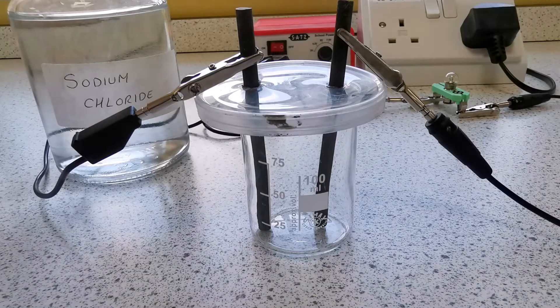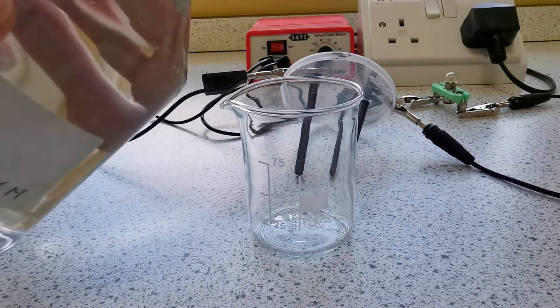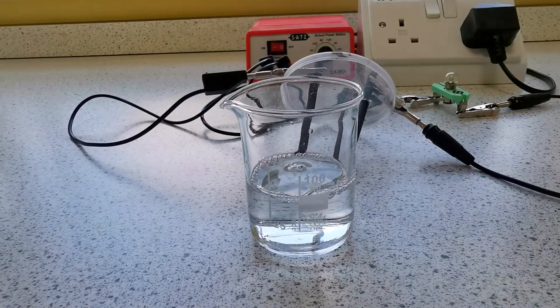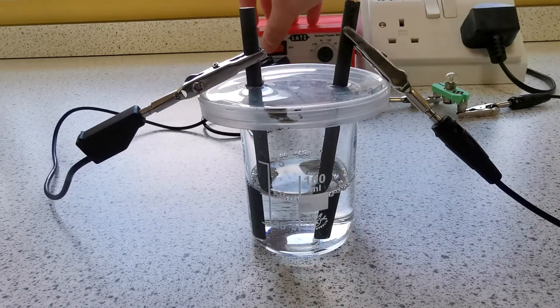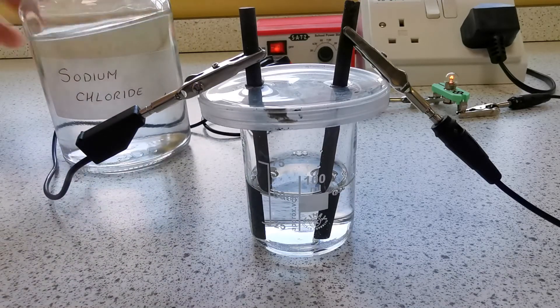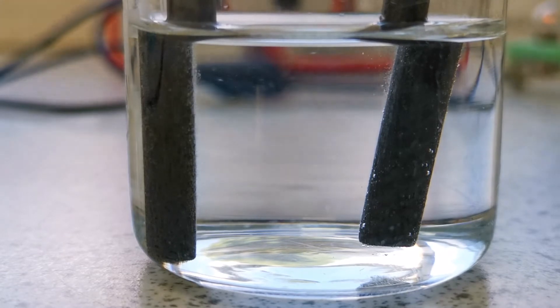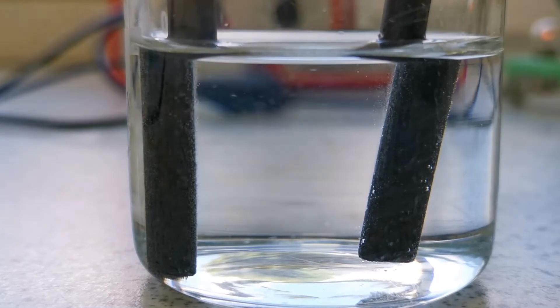The first one we're going to do is sodium chloride, so I'm going to pour 50 milliliters of sodium chloride into this beaker. Then we're going to place the electrodes in and turn the circuit on. As you can see, there are two gases being produced — on the right side we have the anode and on the left side we have the cathode, and we can see bubbles of gas being produced.